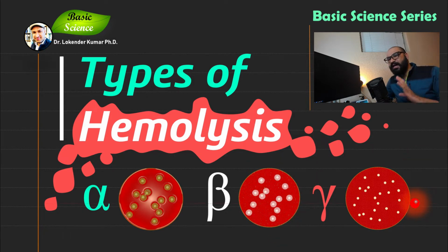And in case of gamma hemolysis, which is kind of self-contradictory, and also it's really weird because gamma hemolysis itself indicates non-hemolytic type of bacterial species, especially Enterococcus faecalis. So it definitely needs to be corrected. Maybe it needs to be updated.